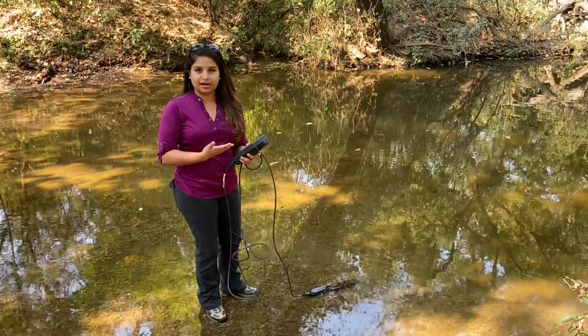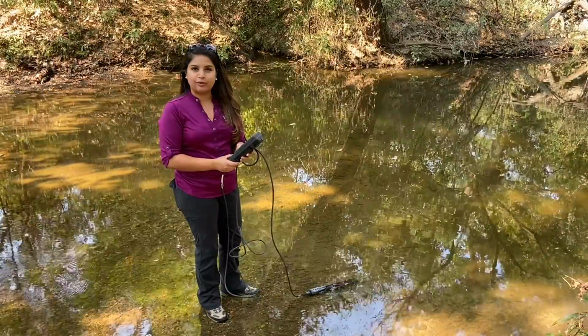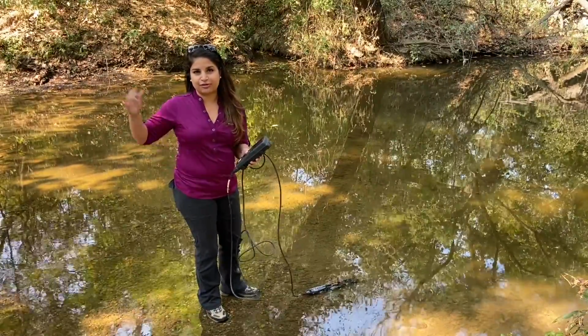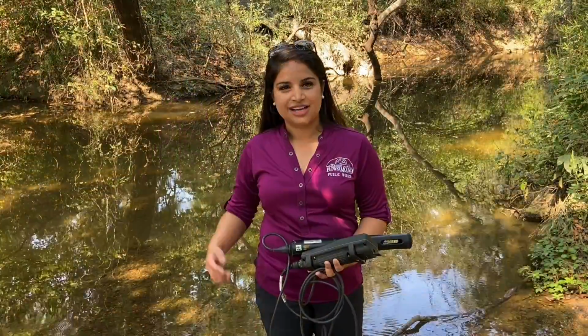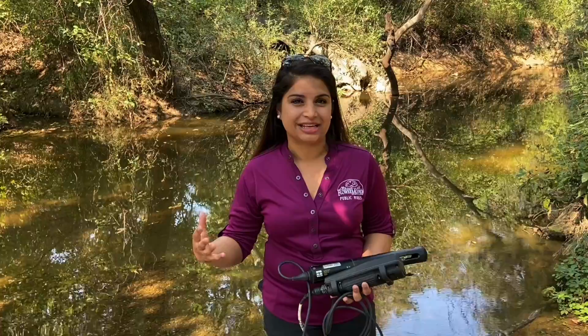And now it looks like my reading is stabilized. We'll go ahead and record this, and that will be our reading for this month of dry weather screening for this beautiful location. So that was a quick snapshot of how we conduct our regular dry weather screening event.